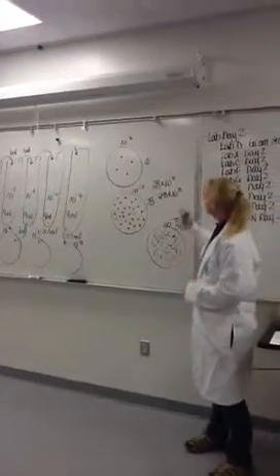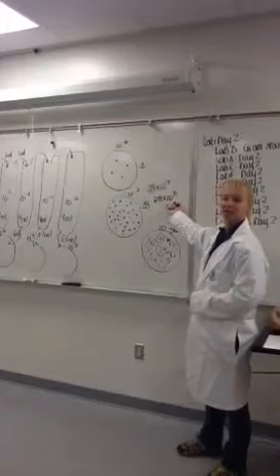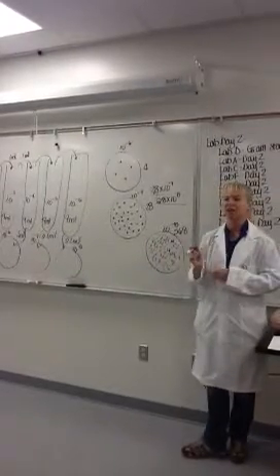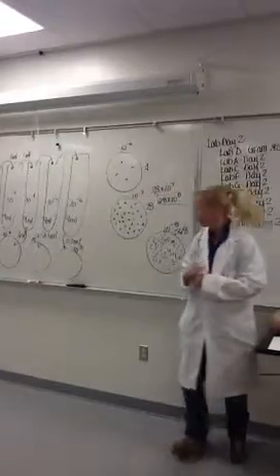Here we go. So in here, this is with the correction for scientific notation. This is your number that you're looking for. So you can see that no need to use a calculator in there at all. Keep it real simple on there.